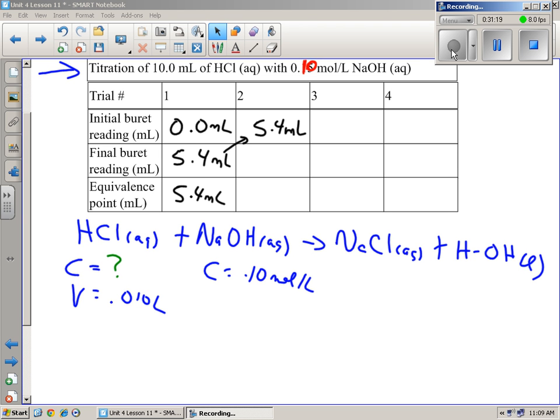Now, look. I know it's about 5.4, roughly. Probably maybe a little bit too much, because it's a little too dark. But even if I went 0.4 over, that'd be about 4 drops, and I don't think that happened. So I could probably add 4.5 milliliters very quickly, yes? And probably still be safe.